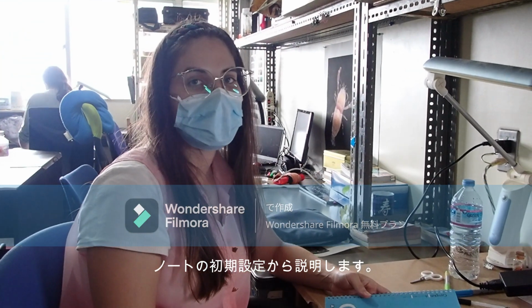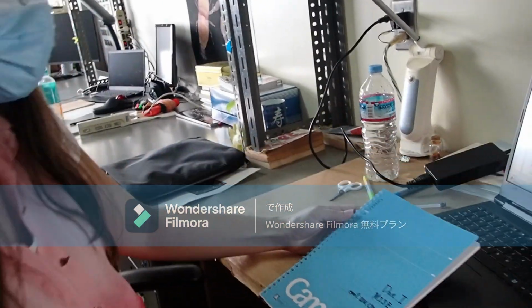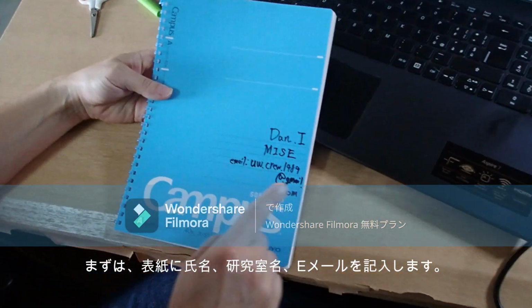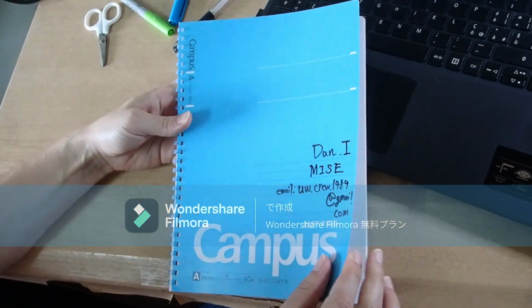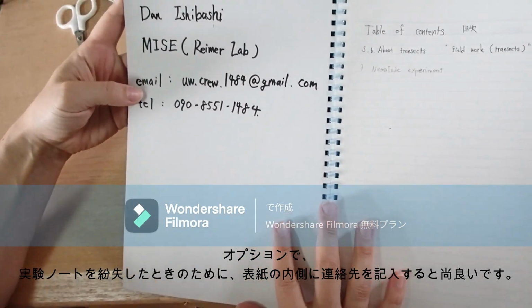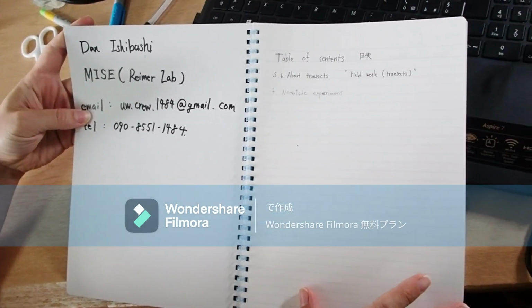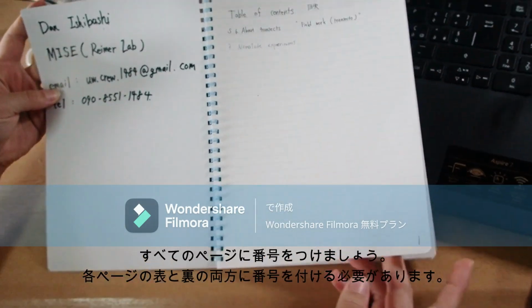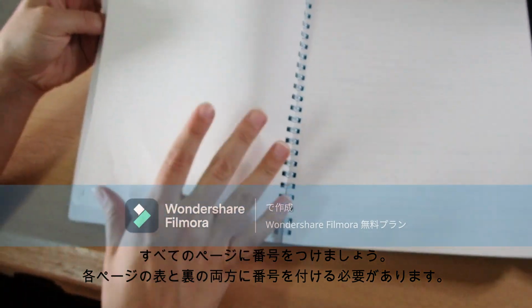So now let's see how to make the initial setup of the notebook. First thing, write your name, the lab, and the email on the cover. Optionally, include contact information on the inside front of the cover in case you lose the notebook. It's important to number all pages in order on both sides, front and back.